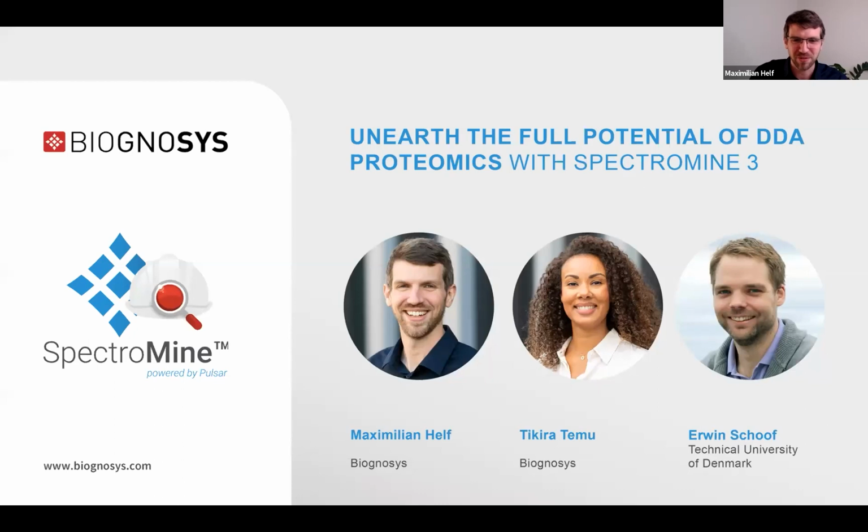My name is Max Helf from the Biognosys R&D team, and I welcome you here to a seminar on unearthing the full potential of DDA Proteomics with SpectroMine 3.